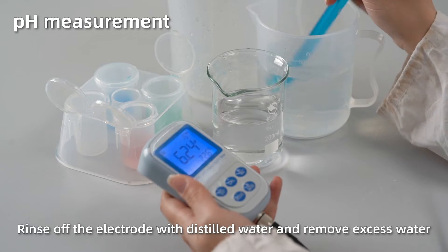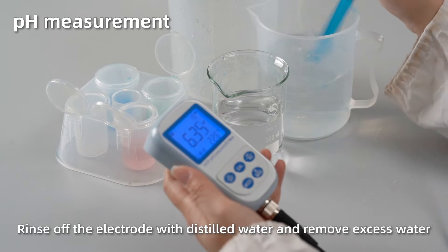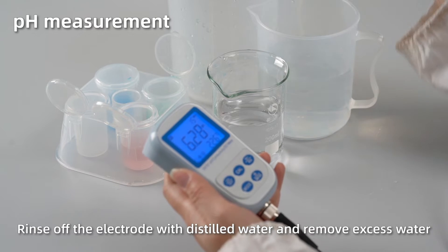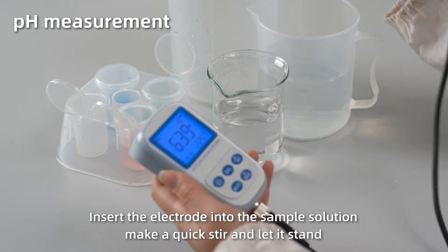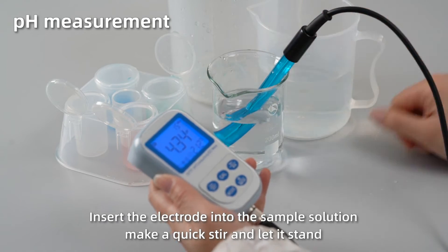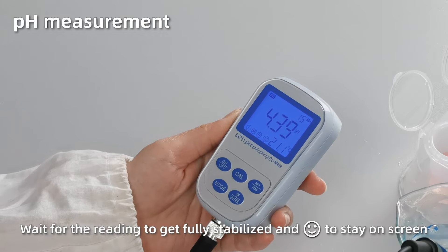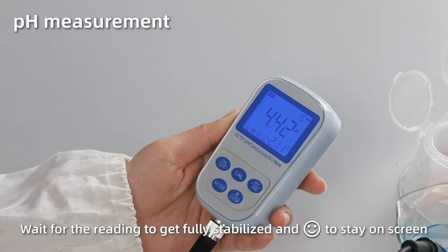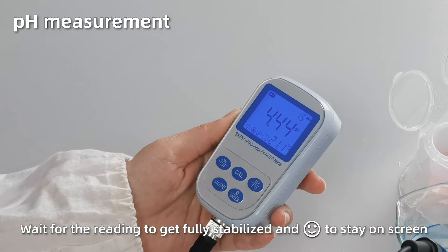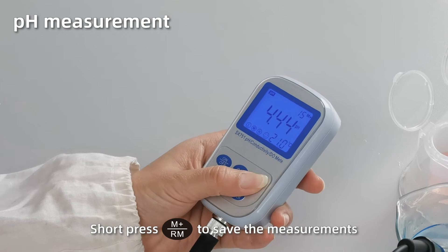pH measurement. Rinse off the electrode with distilled water and remove excess water. Insert the electrode into the sample solution. Make a quick stir and let it stand. When the reading gets fully stabilized and smiley face stays on screen, short press M plus to save the measurement.